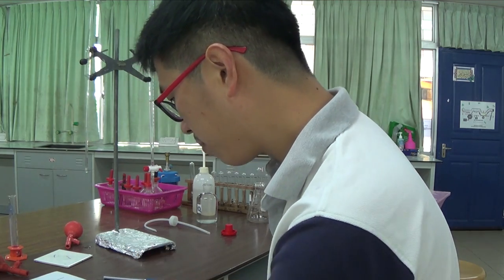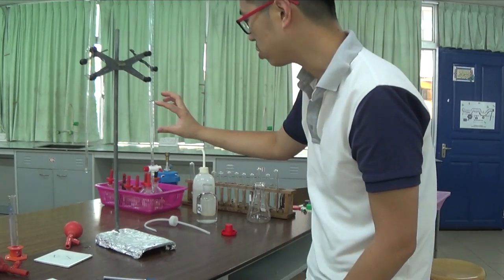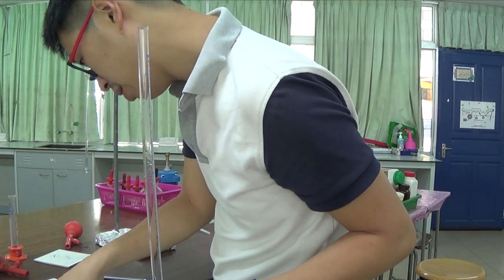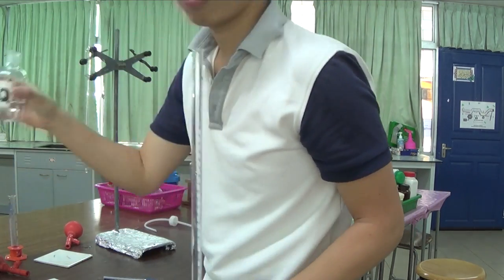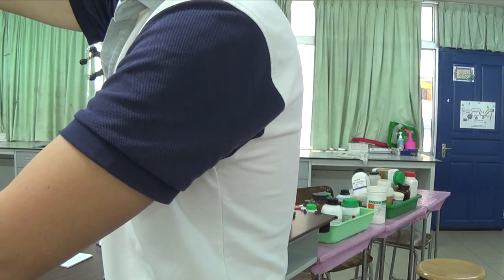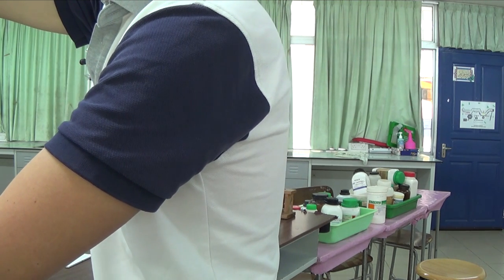Experiment 5 required 18. It required 18 from here. I'm ready down to 43, so it's time to top up the burette. The burette was Q, so I need to make sure that I'm putting Q into the burette. I'll fill it out to the very top again because it seems like we need quite a lot of this thing.